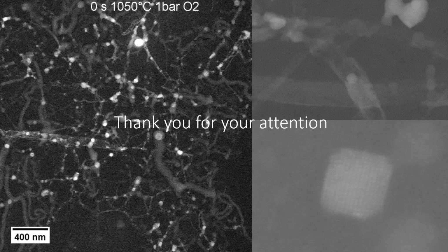Yeah, maybe if I can add to that on the part of the holder, because of this unique modular concept of the holder, it's very easy in preparation of a new experiment to take out the tip, the O-rings and other tubing individual parts, and then clean them, for instance, in a sonicator. You can also clean the holder in a plasma cleaner, even together with the MEMS chip. That will also prepare you very well for a clean experiment.